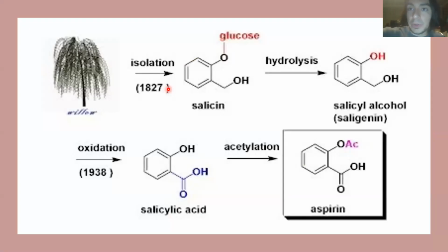All right, so I'm going to go over some quick background information on aspirin. You guys can use this information and put as much as you can into the intro section for your full lab write-up.